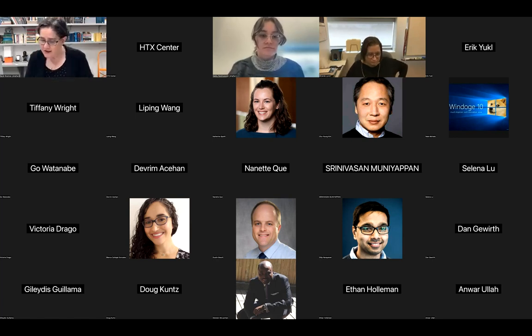Let's see. I'm going to ask one other question here. Again, feel free to weigh in with questions or feedback or anything like that. And this is a question that came up with regards to Eric, your talk, and something that I'm also interested in. Are there any special things that need to be done to work with metals in crystallizing metalloproteins? And so, Eric, I don't know if you want to speak to that.